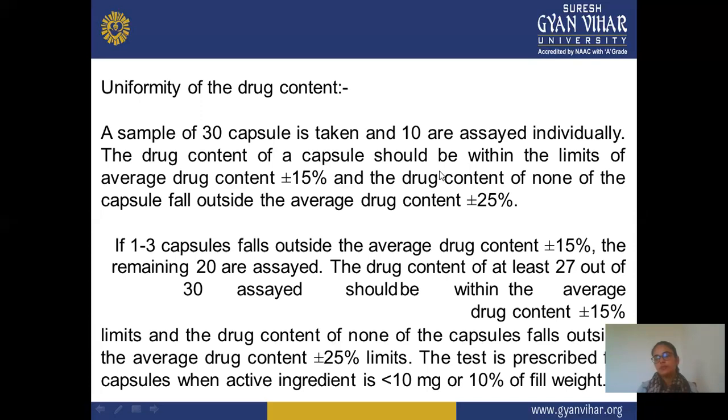It is like a tablet, but your capsule contains less than 10 mg or up to 10 mg, or you can say 10% weight of your average weight or fill weight of your capsule. This is the condition, or acceptance condition, for the capsule in case of less than 10 mg or 10% of the fill weight.